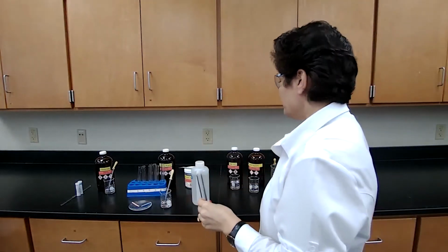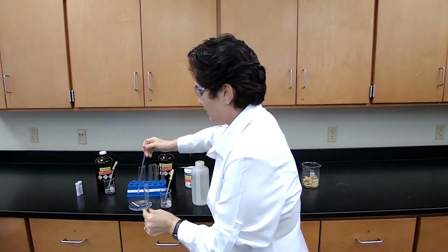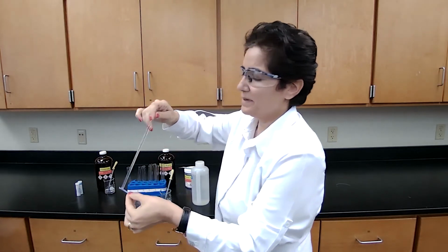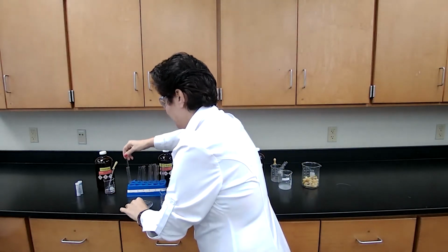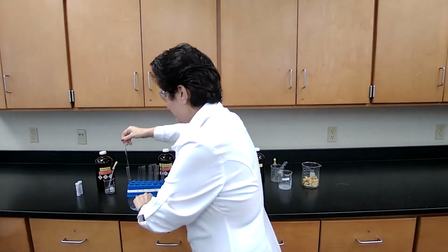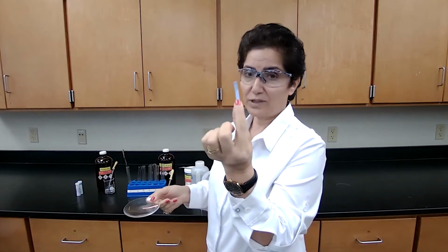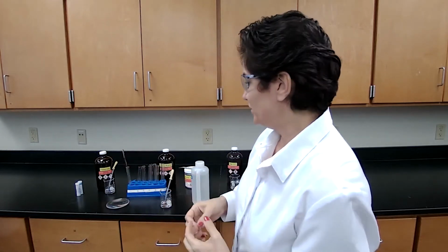For a compound that dissolves in water, we are going to check with litmus paper to see if it's acidic or basic. So with this compound, I add a drop of the liquid to the blue litmus paper. The blue litmus paper remained blue. I'm going to test the liquid on the red litmus paper. The red litmus paper also remained red. This means the compound is neutral, because if the compound is neutral, the litmus paper doesn't change color. We cannot use just one litmus paper. We have to use both of them, because if it's a base, the blue would remain blue, but it would turn the red litmus paper blue as well. But if both of them remain the same, it means that it's a neutral compound.